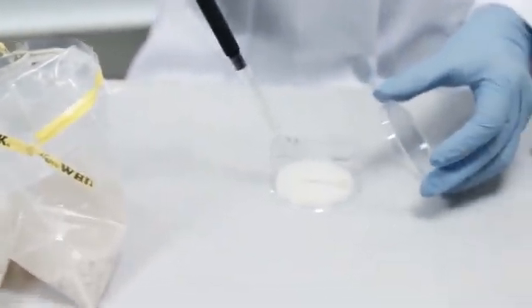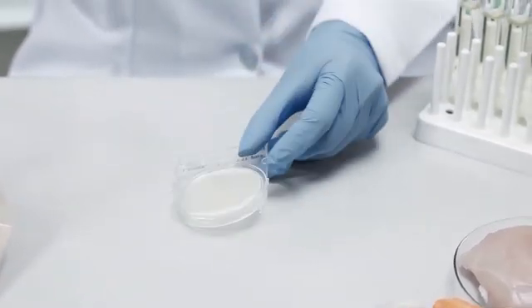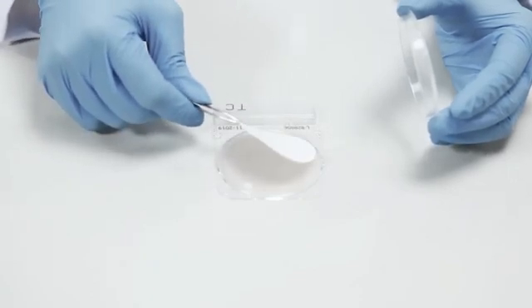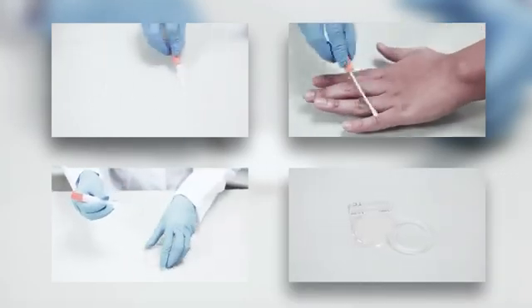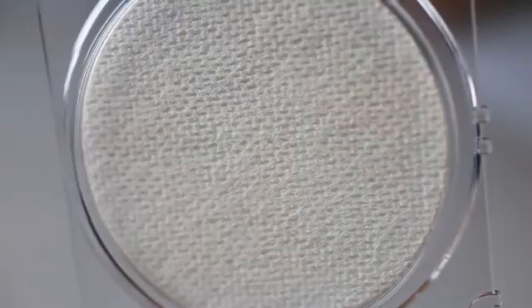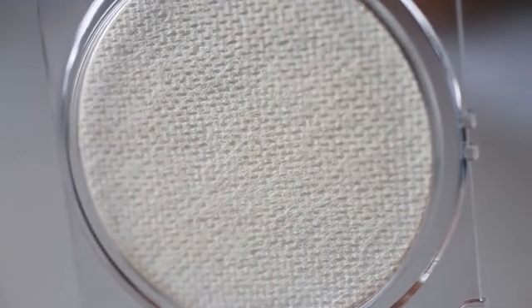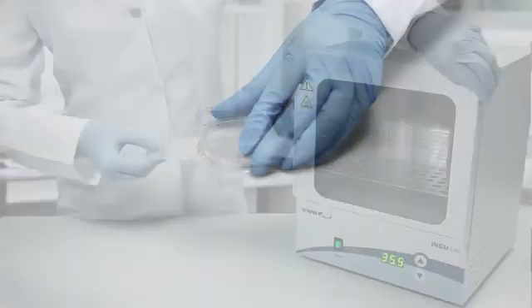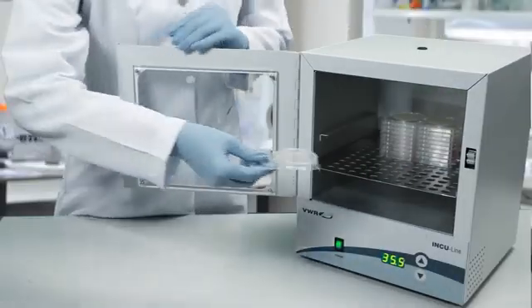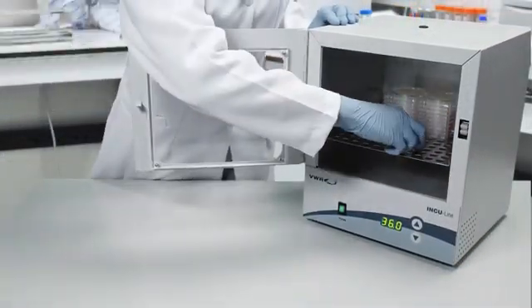Compact Dry is used in rapid microbiological analysis for most solid and liquid samples, membrane filtration samples, and environmental samples such as surface and hand swabbing, and air sampling. Compact Dry is convenient. Experience microbiological testing in three easy steps: Inoculation, Incubation, and Interpretation of results.